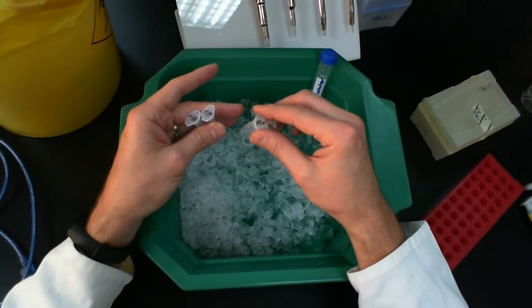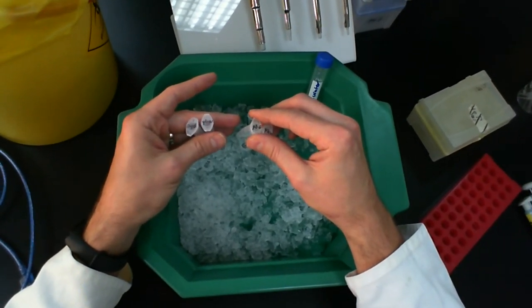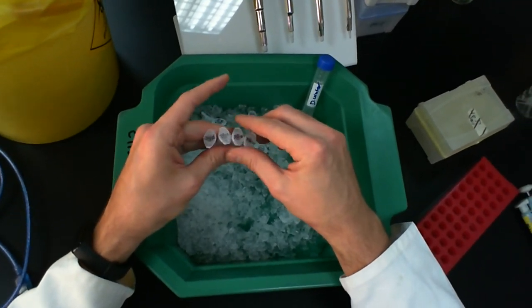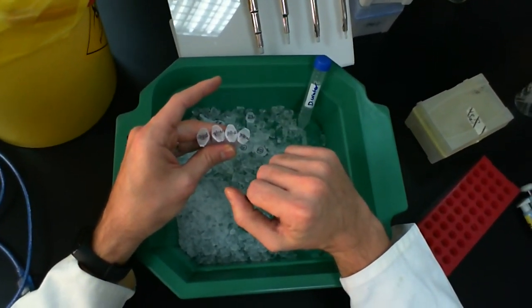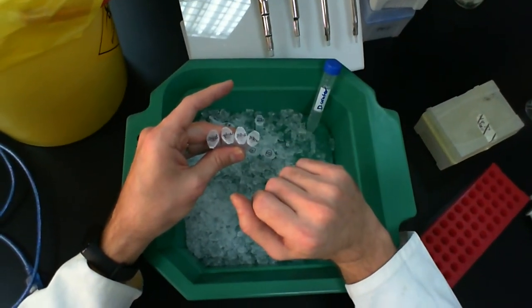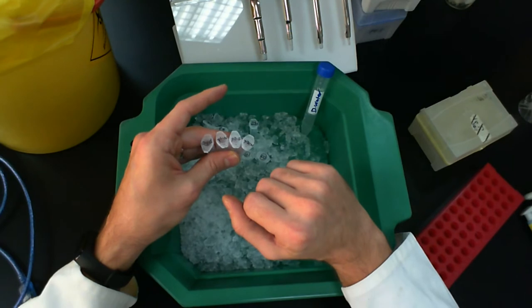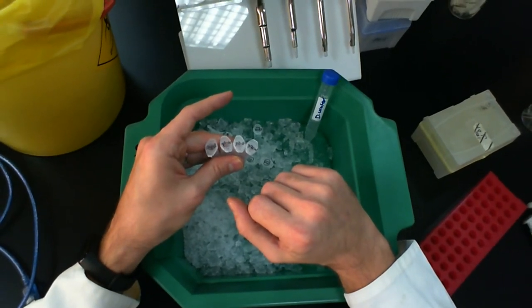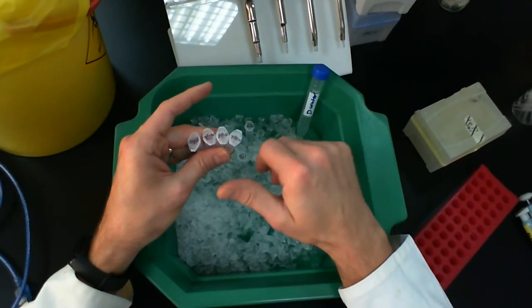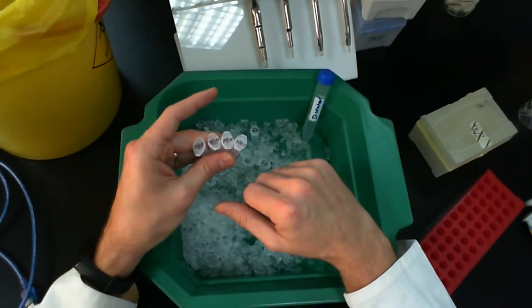37 degrees Celsius is not the most efficient temperature for it, but it still cuts relatively well, whereas BamHI does cut quite well at 37 degrees Celsius, so we're going to put all of these tubes at 37 degrees Celsius instead of having different temperatures. That way we can just put everything in one place and not worry about it. But again, different enzymes will have different optimal temperatures, so it's important to understand that you don't just put everything at 37 degrees Celsius every single time.